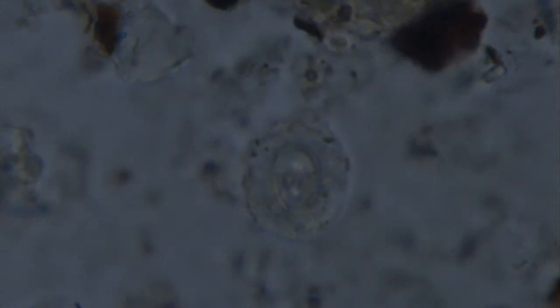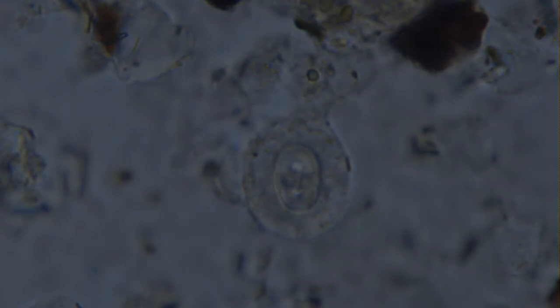Taking in consideration what we said before, only the smaller proximal shield will be visible, and a part of the crystals of the tube can also be seen. This results in an effect that the placolith looks larger in parallel light or parallel polars than in cross polars, as we can see here.